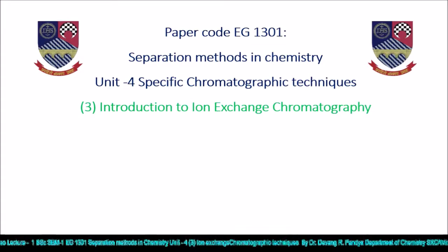EG1301 Separation Methods in Chemistry, Unit 4, Specific Chromatographic Techniques. In this unit, we are going to discuss the third point, Introduction to Ion Exchange Chromatography.